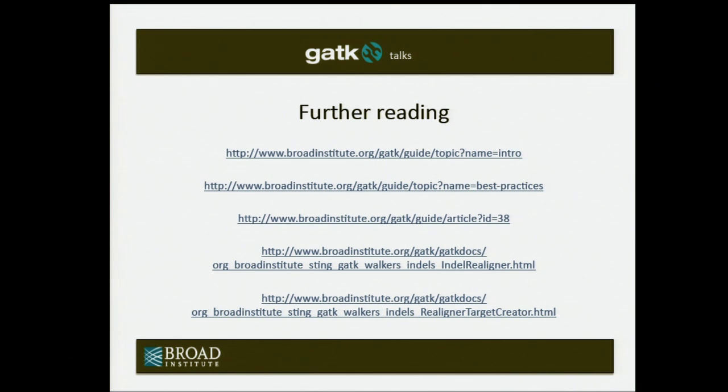Do you see less of such a problem when you use, say, BWA-SW? BWA definitely still has these issues. What you see is not like that original screenshot where every read was messed up. Reads that overlap the indel, where the indel falls in the middle of the read, are no problem. But when the indel falls on the end of the reads, you still have those issues. So you need to get a nice consensus there and make everything match up.